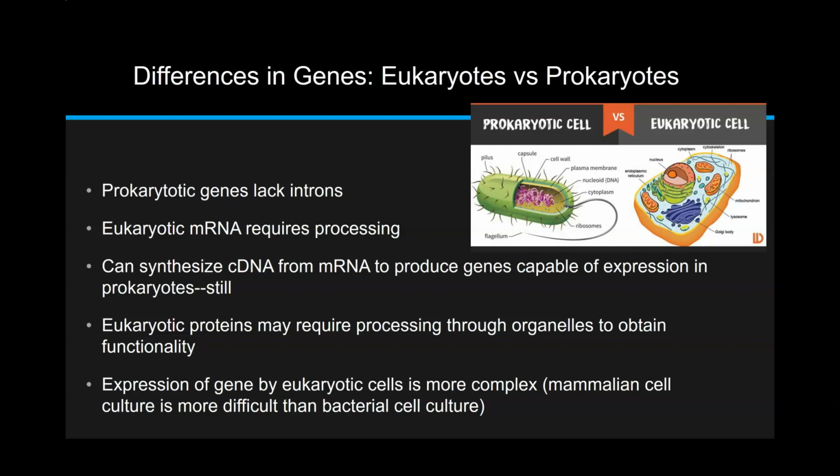To do this, messenger RNA for the gene is isolated and reverse transcribed into DNA by a viral enzyme. Then it is called cDNA. This is inserted into a bacterial cell vector. So yes, it can be done, but sometimes the protein produced by something like E. coli doesn't work correctly, hence the need to have the protein made in a eukaryotic cell.